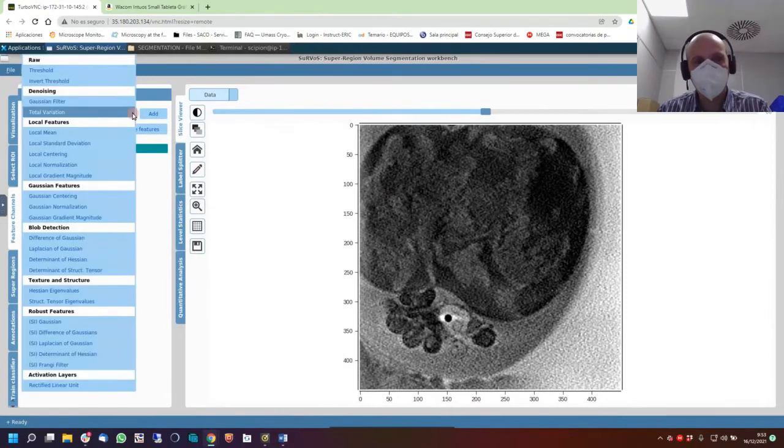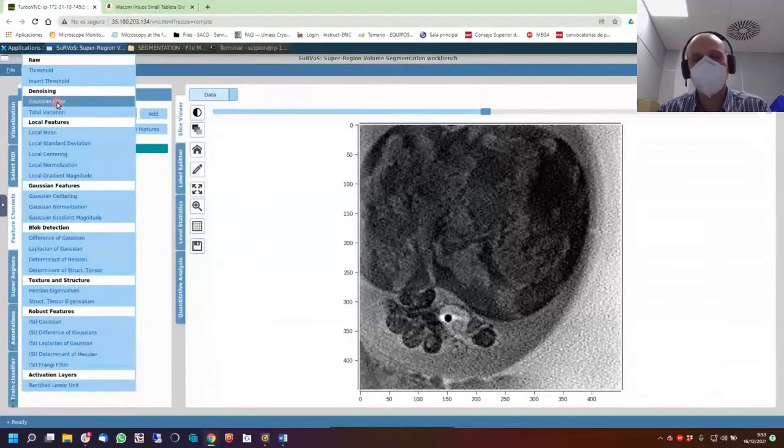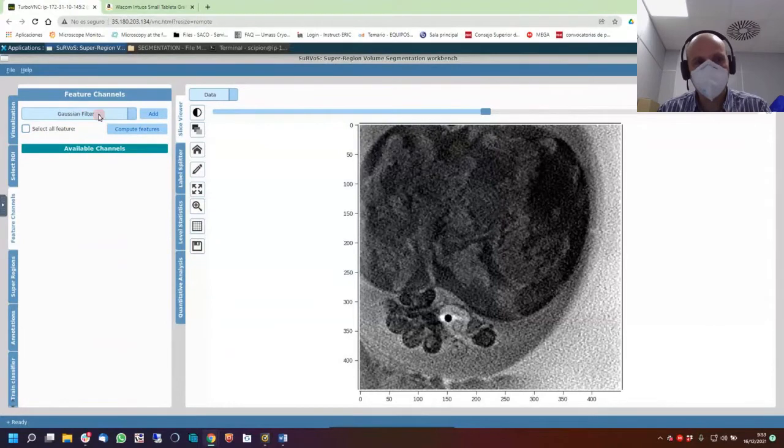You see? And you have a huge amount of filters. It's probably my problem. My internet today is not stable, so it keeps hanging. So okay, I'll just restart and come back. Thanks. Sorry. I'm sorry.